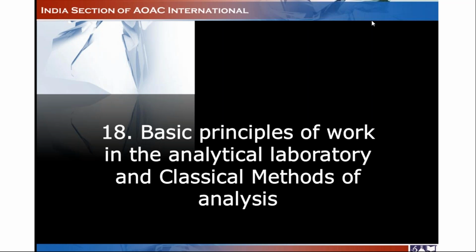So now let us look at what are the basic principles that you should be aware of in an analytical laboratory. I'm going to start from the basic, that is the SI units of measurement, to a large number of calculations that you need to know when you are making solutions.